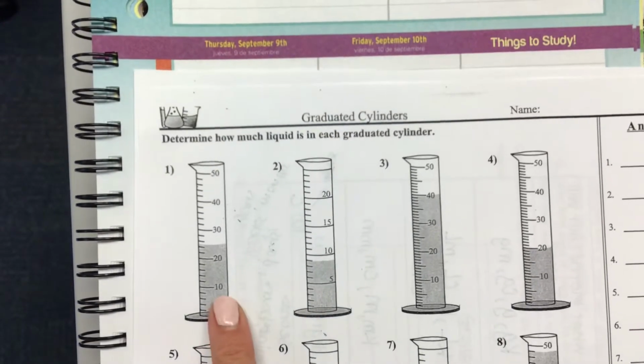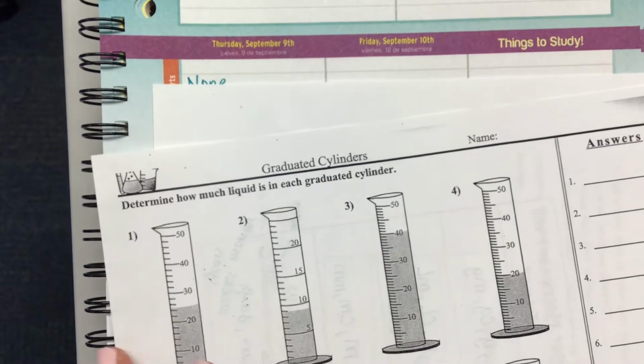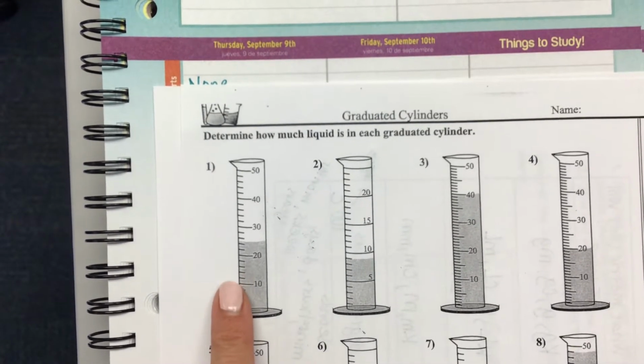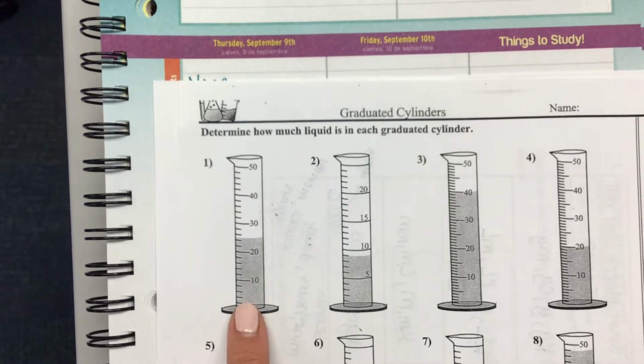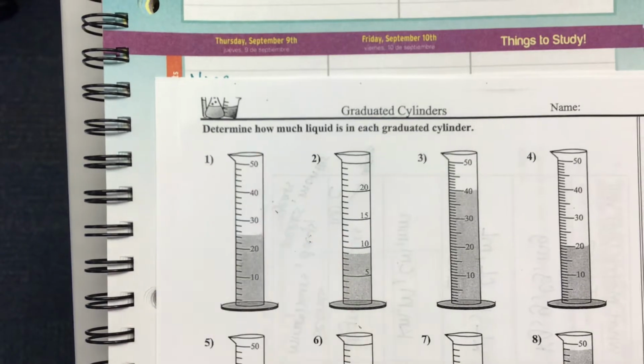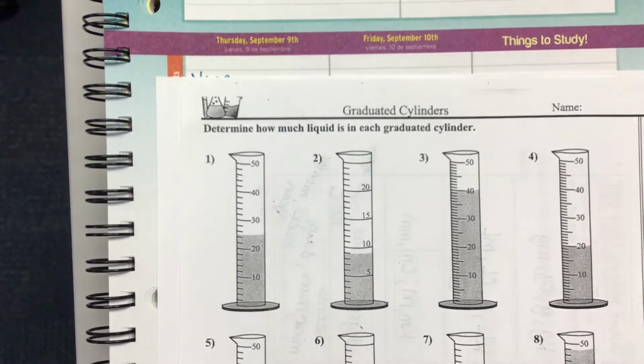Looking at our measurement packet, we're on the page called Graduated Cylinders, and we're talking about how to measure the volume of a liquid using a graduated cylinder. The most important step is to look and see what our scale is along the side. Remember when we talked about graphing and we had a scale and an interval? Do you remember what that meant?